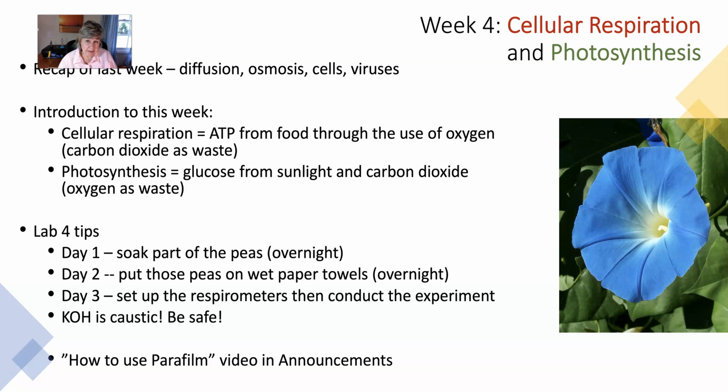Okay, let's talk about the lab this week. I mentioned last week in the announcements that you're going to have to start this experiment at least 4 days ahead of time because you have to soak the peas in water, the peas that you're hoping are going to germinate, which they did for me, so I'm sure they will for you too.